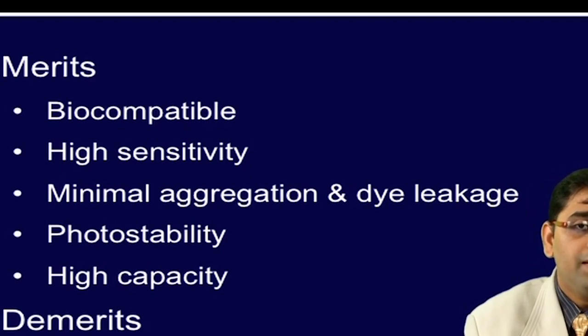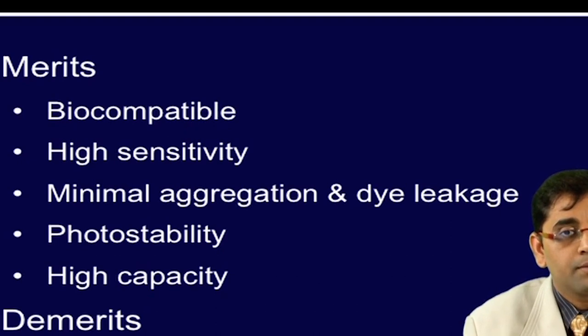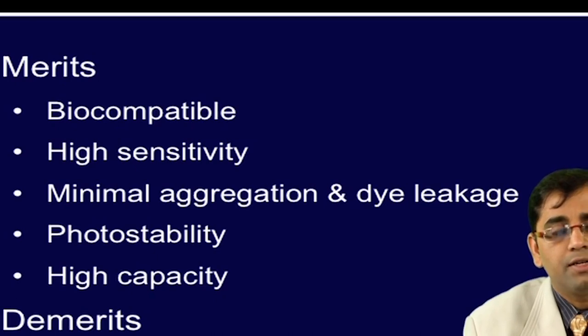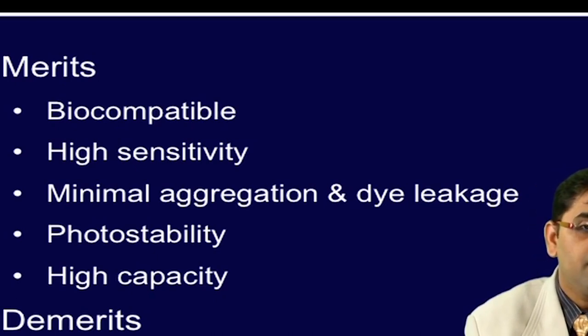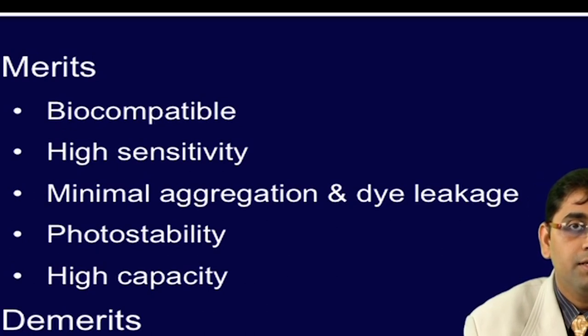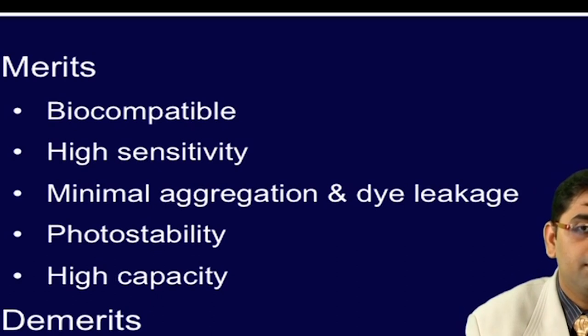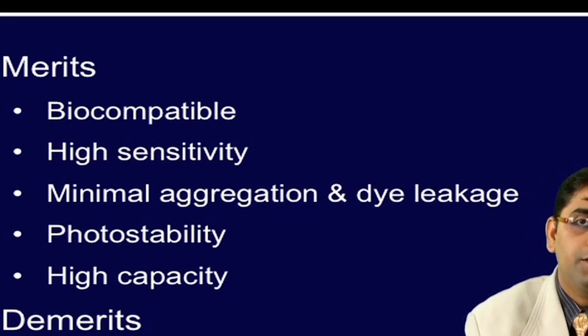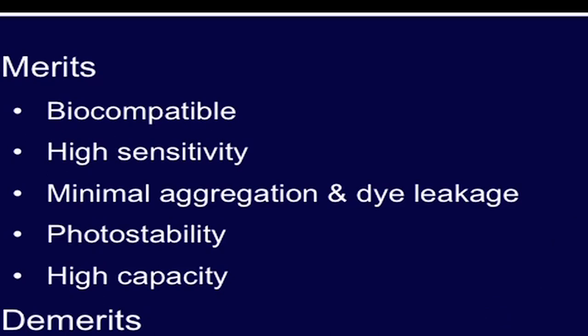Application of various functionalized silica nanoparticles has been demonstrated in diversified fields such as biomarker discovery, drug delivery, and multiplex signaling in biomolecules. Its various merits include biocompatibility, high sensitivity, minimal aggregation and dye leakage, photostability, and high capacity. The demerits of dye doped silica nanoparticles include its complex synthesis process.